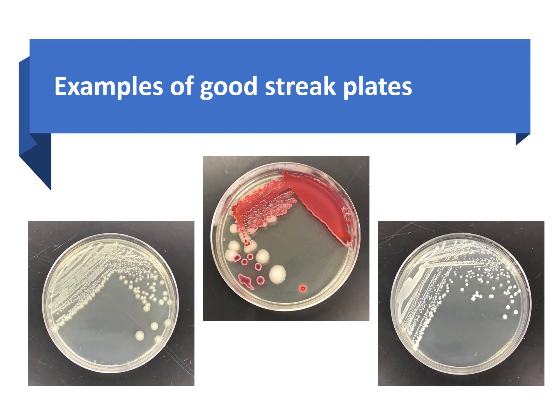And so this is the importance of the streak plates. Do you guys see how right here, when we started off in that first quadrant, just by looking at that first quadrant, can you tell how many different species of bacteria you have? No, right? So in that lawn of bacteria, you can't actually tell how many different species you have.